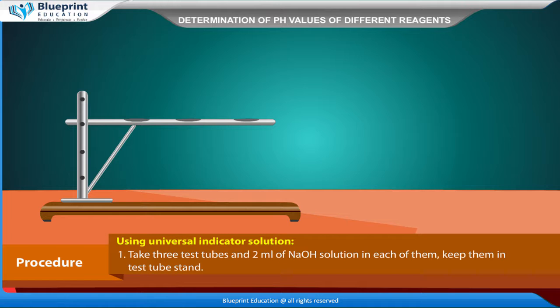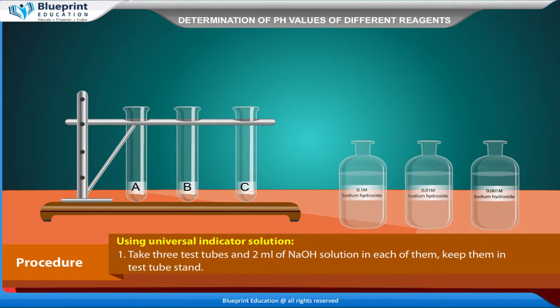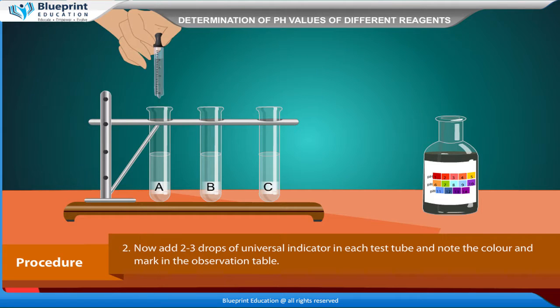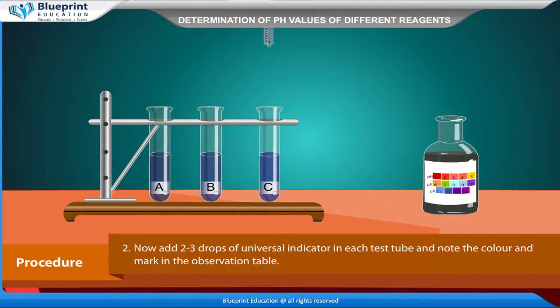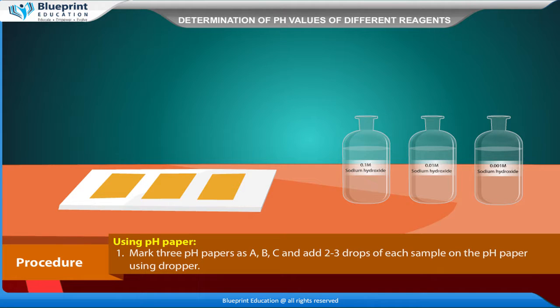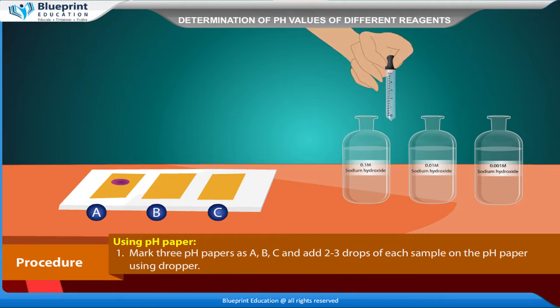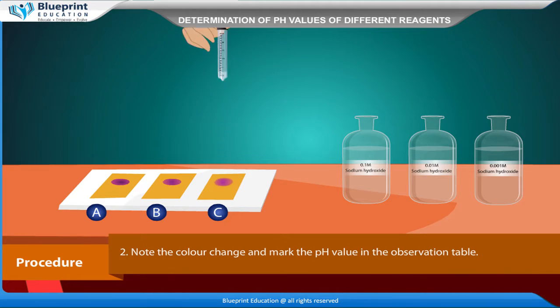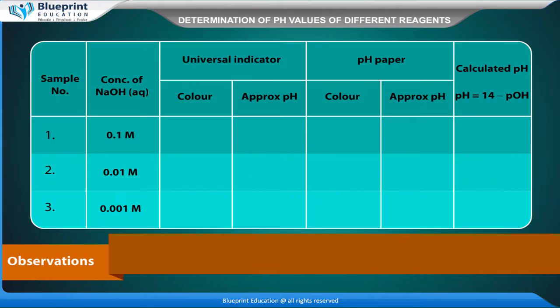Procedure using universal indicator solution: Take 3 test tubes and add 2 ml of NaOH solution in each, then keep them in the test tube stand. Add 2-3 drops of universal indicator in each test tube and note the color in the observation table. Using pH paper: mark 3 pH papers as A, B, C and add 2-3 drops of each sample on the respective pH paper using a dropper. Note the color change and mark the pH value in the observation table.